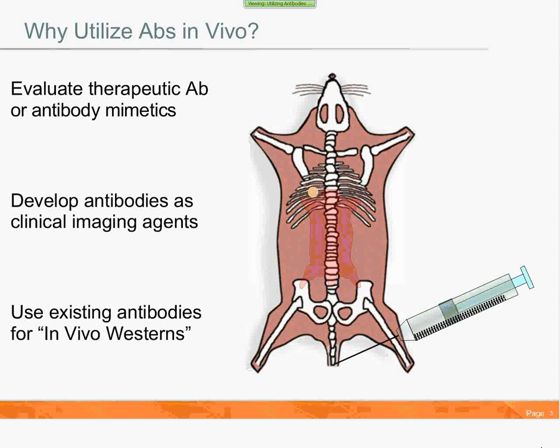However, for in vivo, or at least if you want to keep your animal alive in an in vivo experiment, you have to keep the integrity of your membranes intact. Thus, you're really primarily looking at targets that are expressed on the cell surface or in the extracellular matrix, relatively tightly bound to the cell. Imaging of intracellular ligands is really best left to small molecules or things like small molecules.